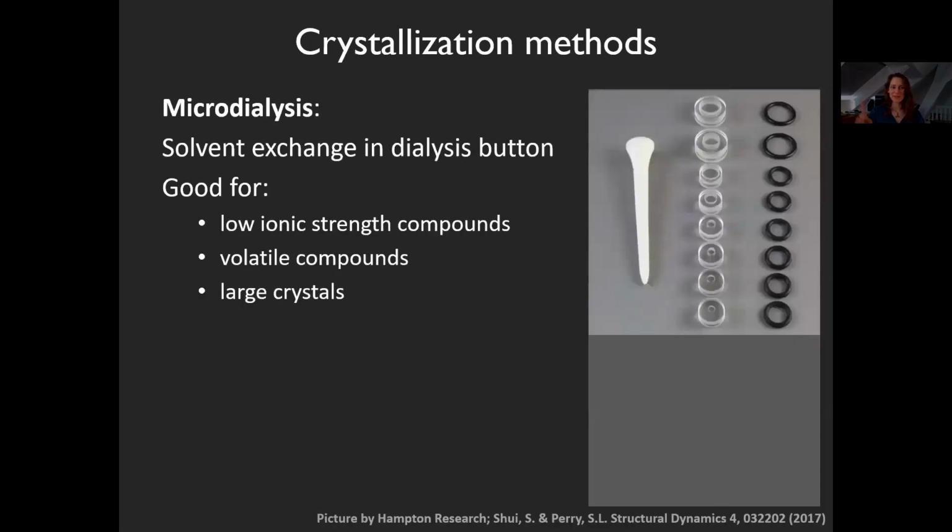Now, here's microdialysis. In microdialysis, we have a button in which we bring the protein solution. Then it is covered by a dialysis film, which will let water go in and out, but not protein. And then there happens a solvent exchange, which will concentrate the protein and hence also lead to crystallization.